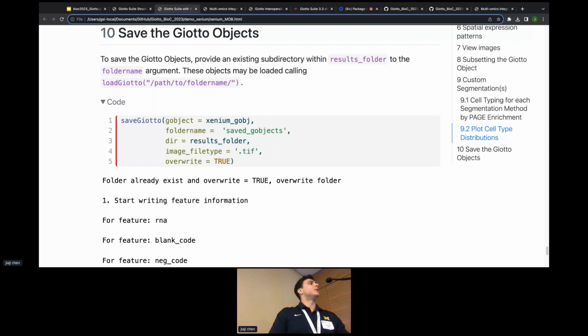So I can answer that a little bit. The agnostic portion of it just means that we have all the tools needed to basically put together pretty much any set of spatial information that you have, regardless of the platform. So this can be subcellular information, it could be Visium information, and then we can analyze that downstream with aggregate methods.